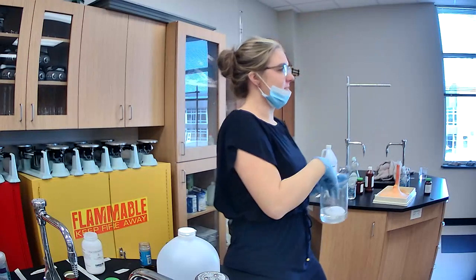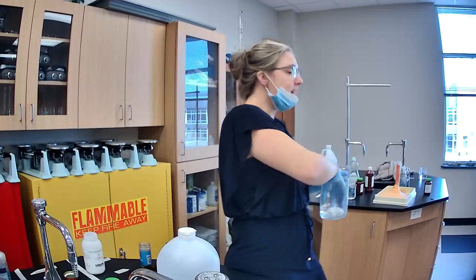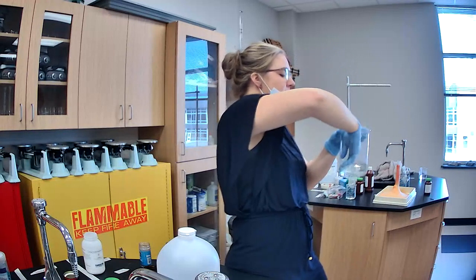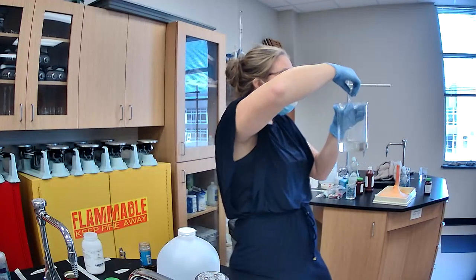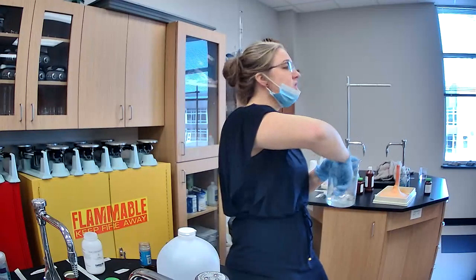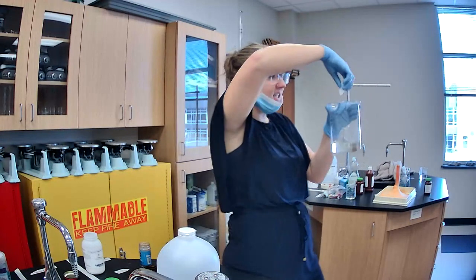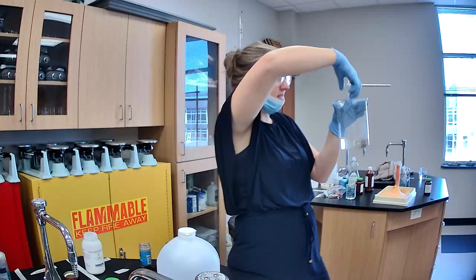Let me explain. Polystyrene foam is really just polystyrene filled with millions of tiny little air pockets. As the polystyrene dissolves in the acetone, we release the air pockets, and what's left behind is this sticky goo. Kind of crazy, huh?